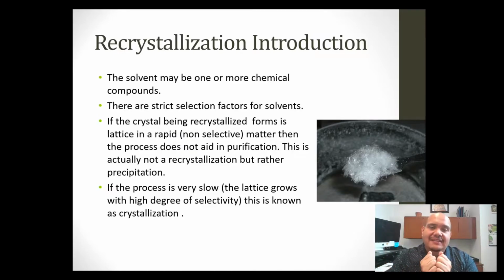So it depends on what you're looking for. The best thing to do when you have a solute that needs to be recrystallized in a solvent that is polar and nonpolar is to take a solvent that is already somewhere in the middle on the polarity index.